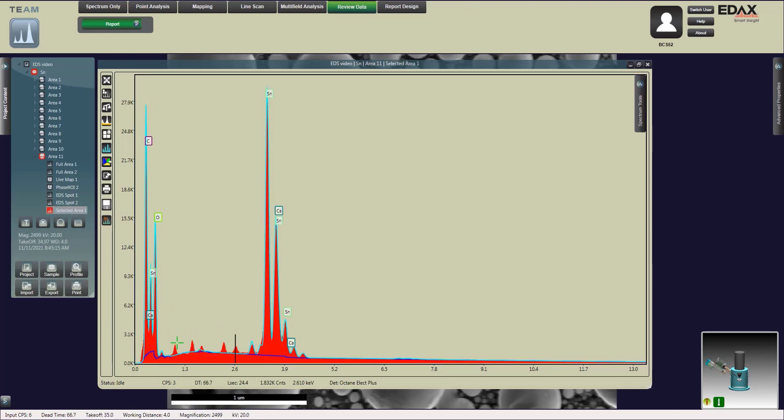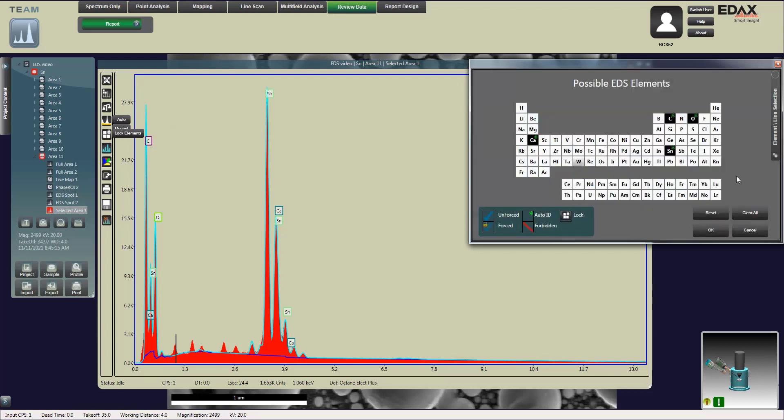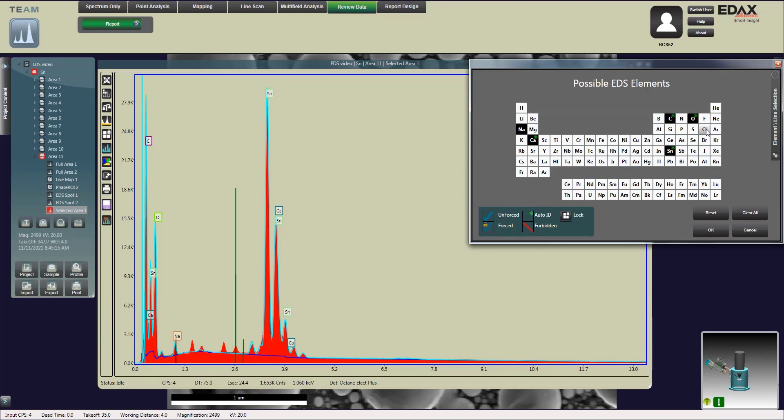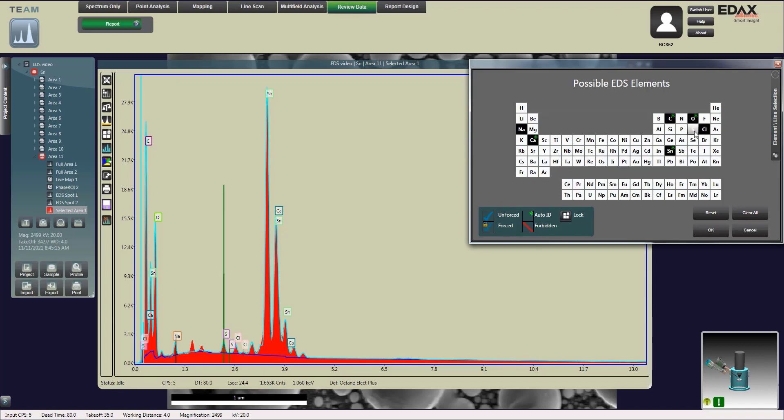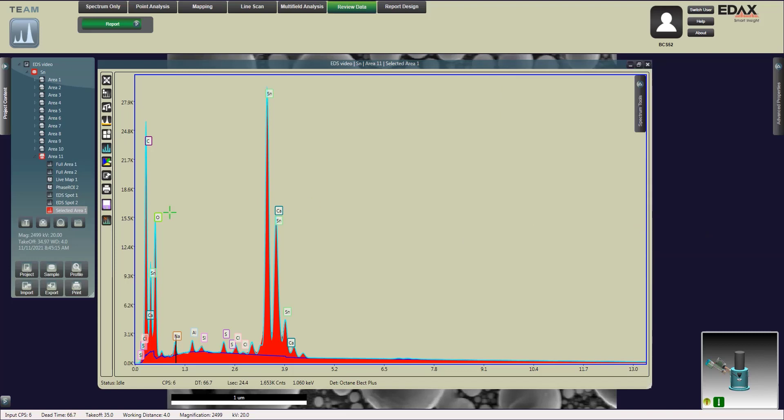Once we selected all of our elements we're going to save, lock the elements in place and move on to the third area. This has a lot of the similar elements as the second spot. The other option is to actually pull up the periodic table and hover over any of the elements and it'll show you where the peak line should be. This time instead of clicking on the peaks, we're just going to click on the elements on the table and try to fit the data that way. Once again we'll save.